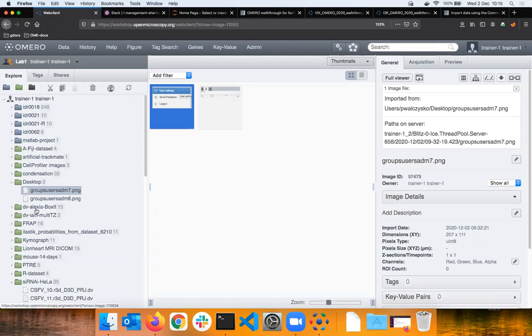If the original image is changed, moved, you mean on disk? So there are two things. If the original is changed, do you mean moved location? Christina, is that correct? Feel free to, if you can speak to it. Okay, it's easier. Yeah, I'm not good at typing fast.